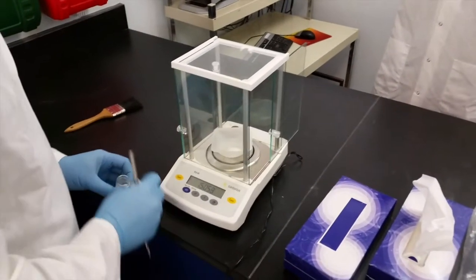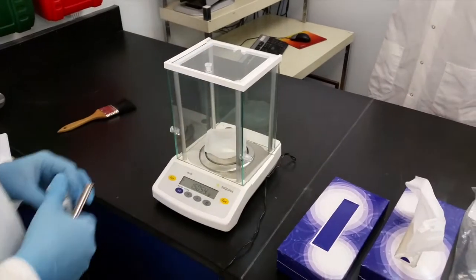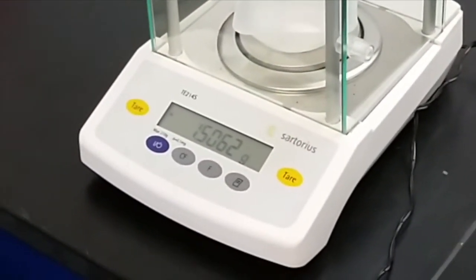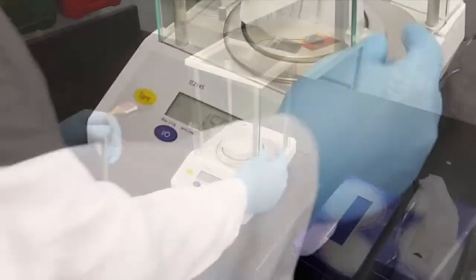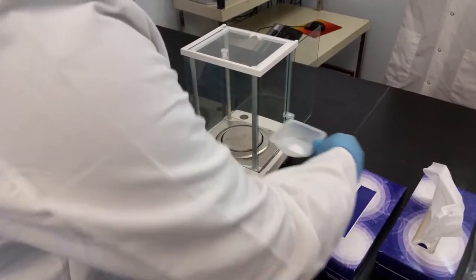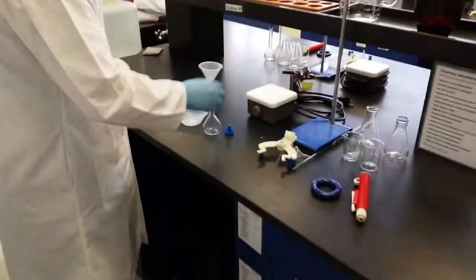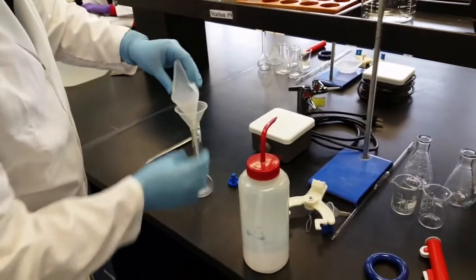My mass here is 1.5063. So you write down this exact number, all the decimal places. So now you have your acid. Using this funnel, we'll add the solid to the funnel.